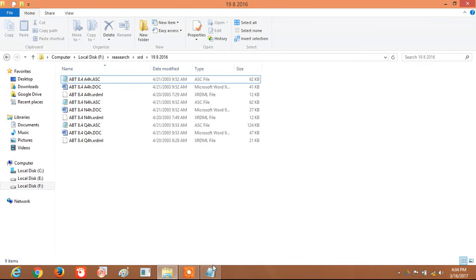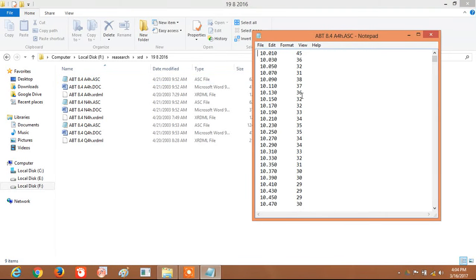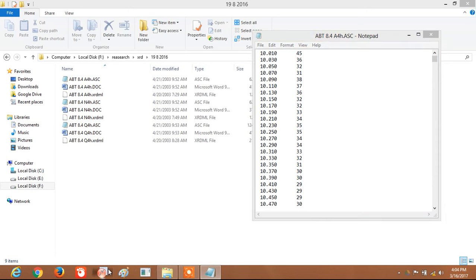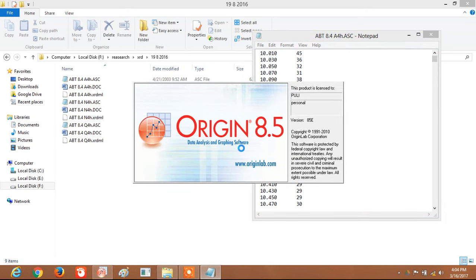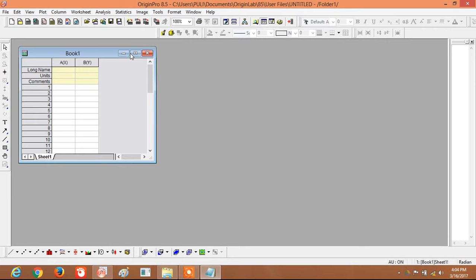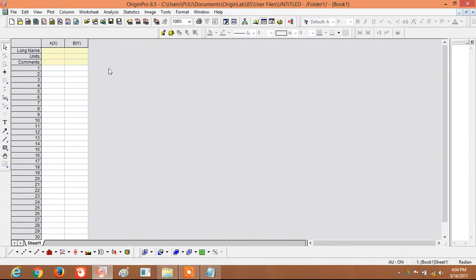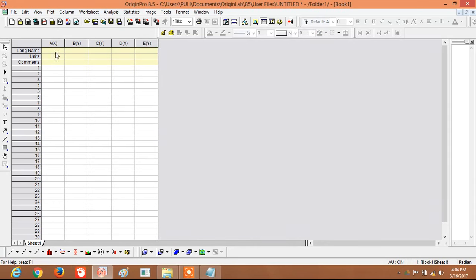This is my data. By using this data I can draw the graph in Origin. When you open Origin, only two columns will appear. If you want to increase the columns, just click the 'Add New Columns' button. Now, before drawing the graphs, we first have to add the data. There are many ways to add the data.